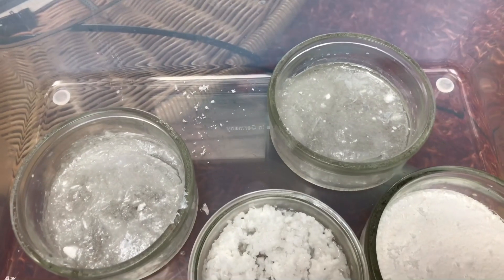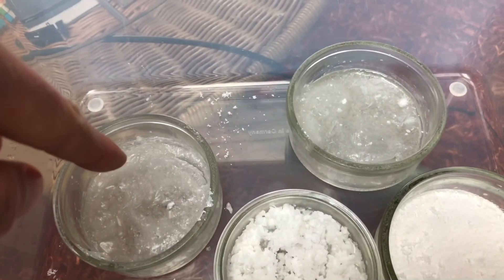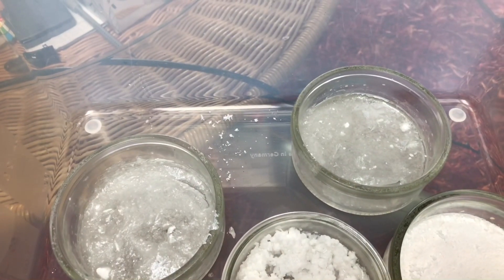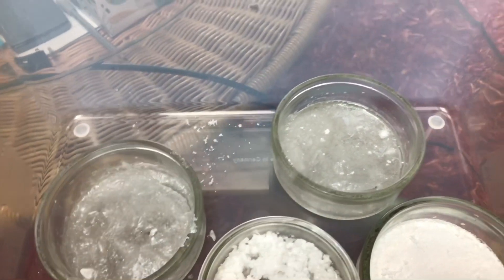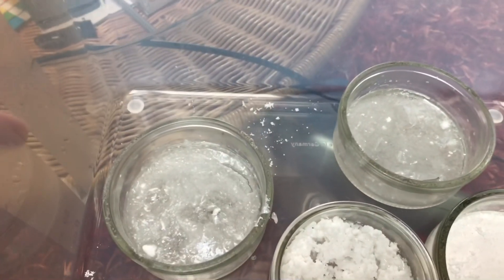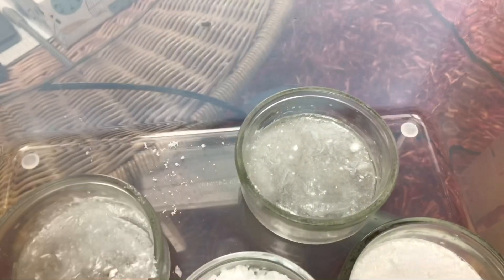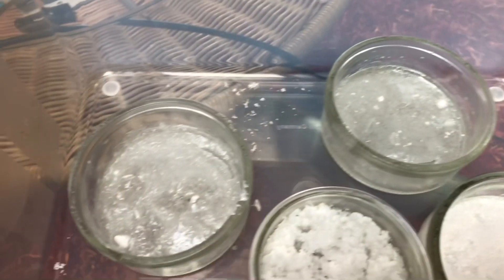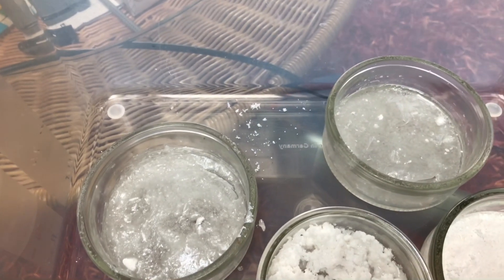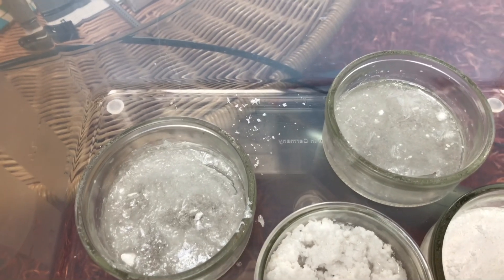Welcome back everyone. This is an old video I just found on my hard drive — this is lead acetate. I decided to finally publish it, even though after an entire year these have still not dried. They are still wet with acetic acid and I don't seem to be able to dry them, so I'll just use them in a future run for something else where the lead acetate does not have to be dry. Enjoy the video.